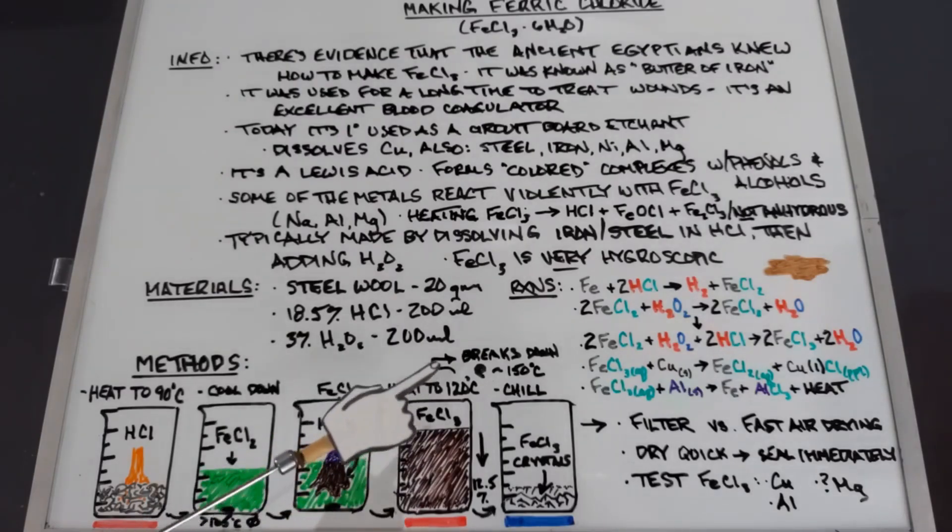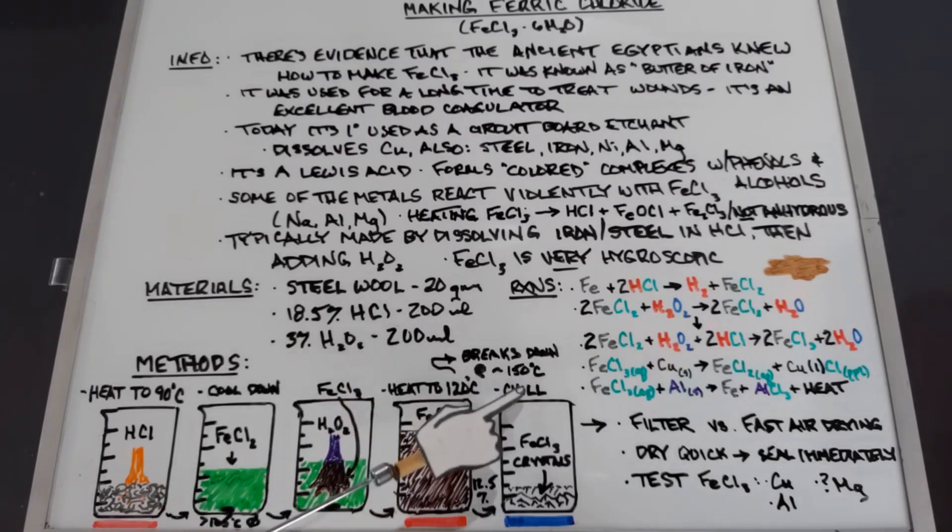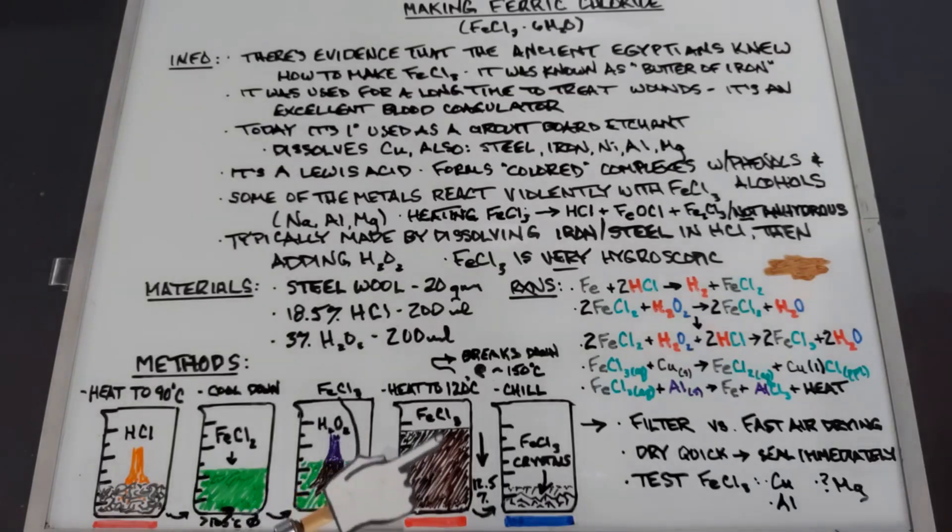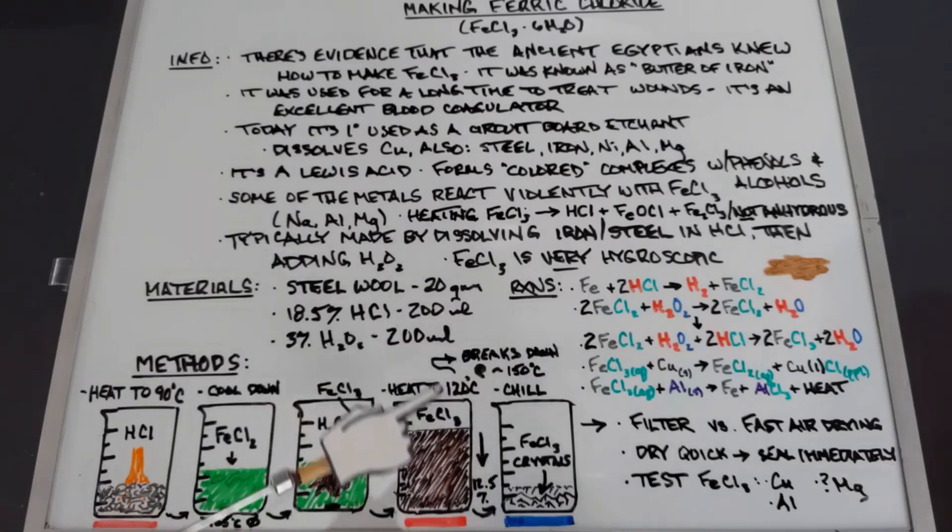So I'm going to heat this — you can heat up to 120°C; ferric chloride breaks down at 150°C. From prior experience, once you get down to around 12.5% of the original volume, about 50 milliliters of the 400, it will start to crystallize. That's a personal benchmark — it might not happen every time — but it tended to work. Once most of the water is driven off, we'll chill it to get ferric chloride crystals.